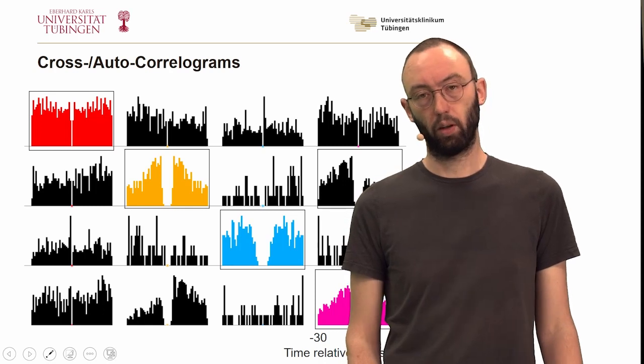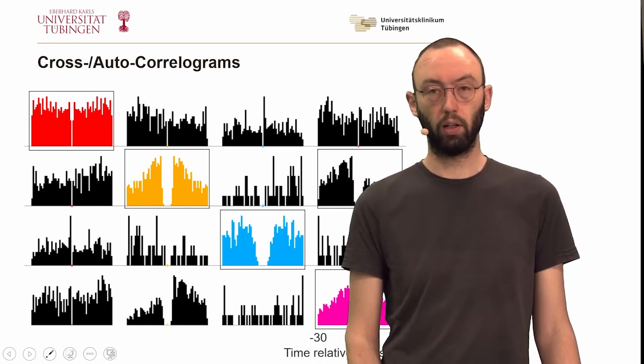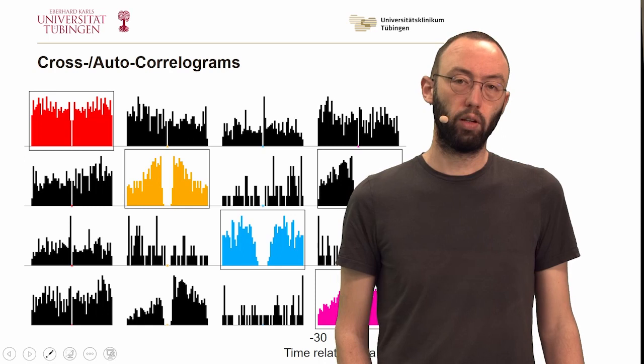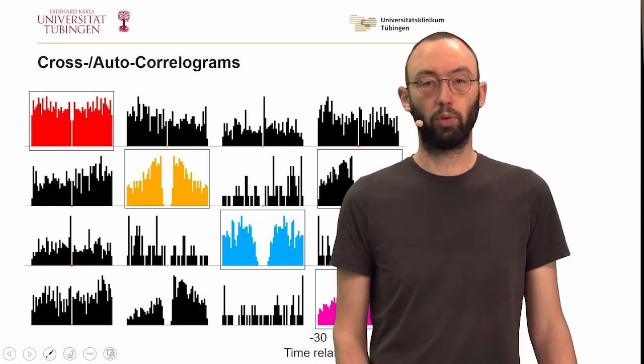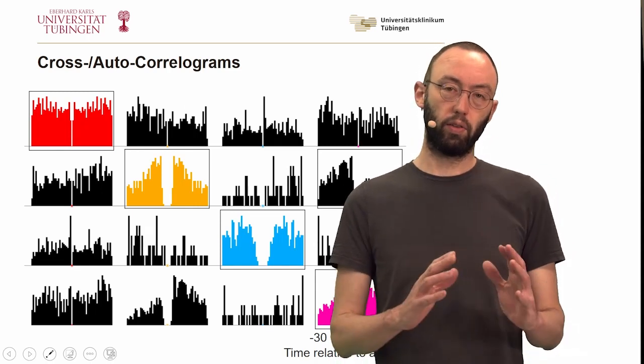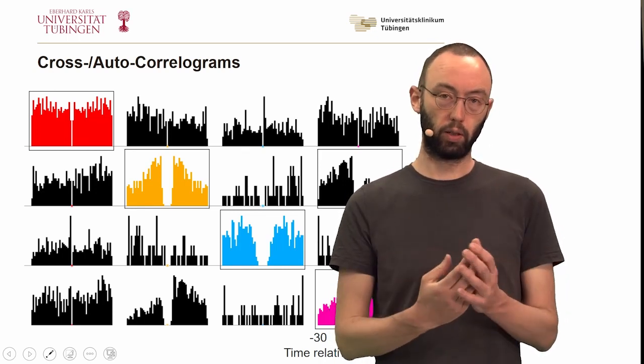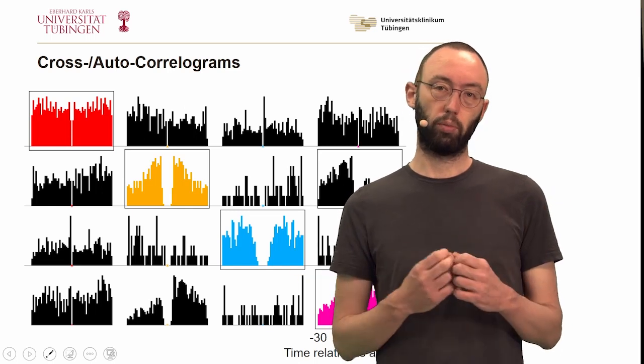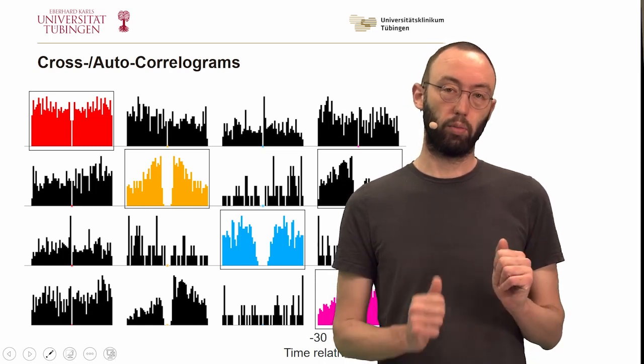But what is striking is when you look at the joint cross-correlogram here of the orange and the pink cluster, then this still shows a refractory period. This is remarkable because it indicates that very likely the spikes in this orange and in this pink cluster actually come from the same neuron. Because you may remember that the clusters of the orange and the pink clusters were also overlapping. So probably there can be factors like electrode drift or spike amplitude adaptation. These were spikes from an individual neuron that changed slightly over time and thus ended up into two clusters.